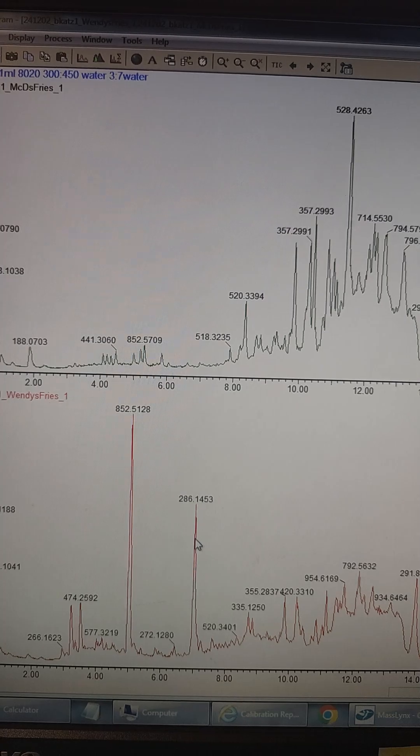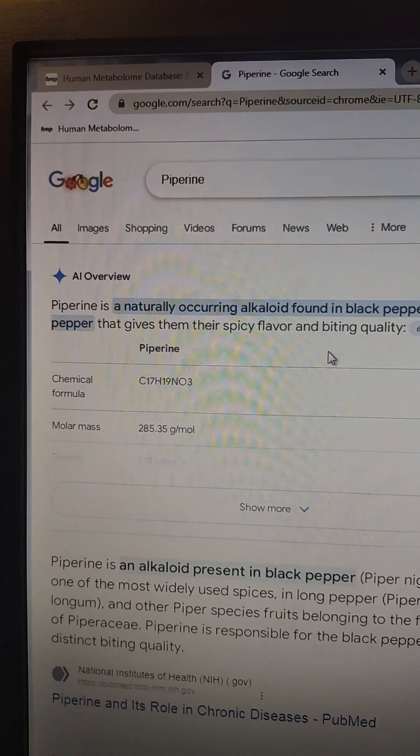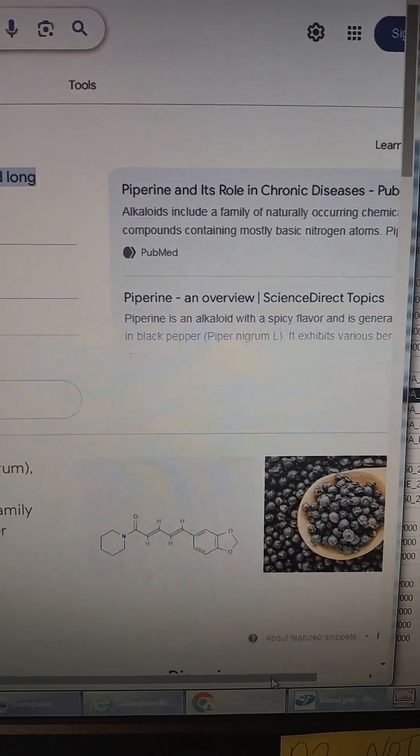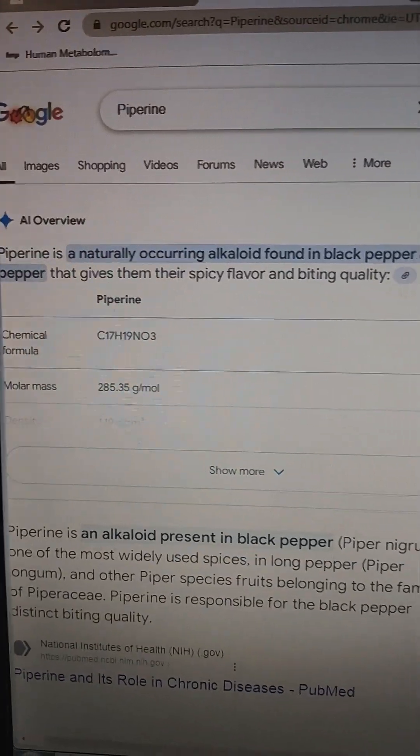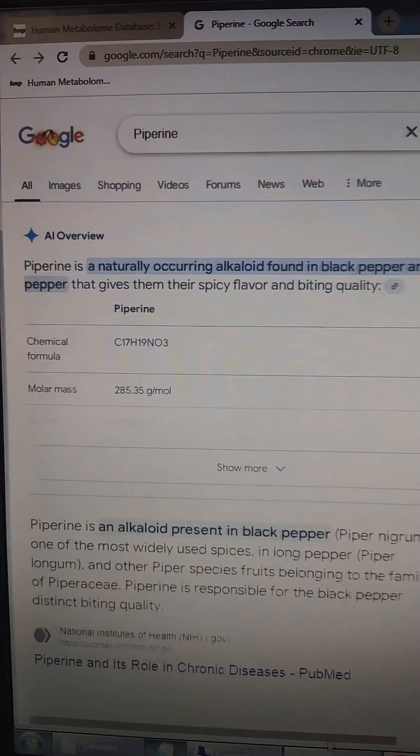which is only in the Wendy's french fries. Piperine makes the most sense. And so that is the flavor of the french fry. And I guess those french fries from Wendy's do have a bit more black pepper and flavor and spices on them. Then the McDonald's french fries are a little bit more plain.